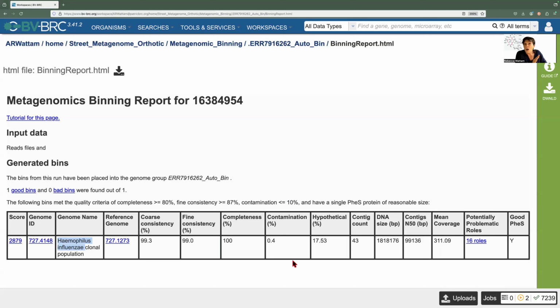And like I said, all bacterial genomes have it, but they have a certain number. I generally think around 30% of a lot of the genomes have hypothetical genes. If it was a lot higher than that, if it was 50%, 80%, I would start worrying about it, and it would indicate a poor quality genome.